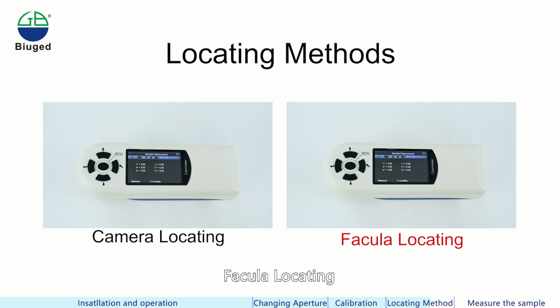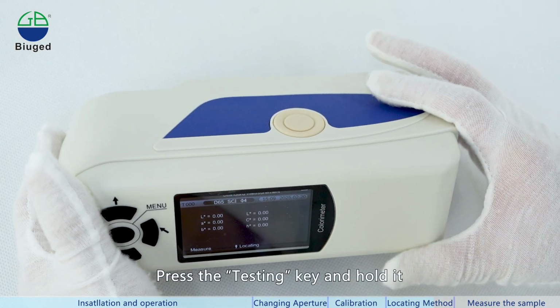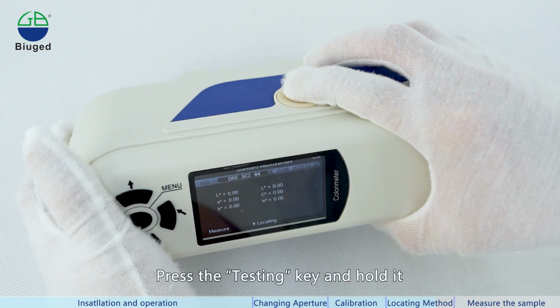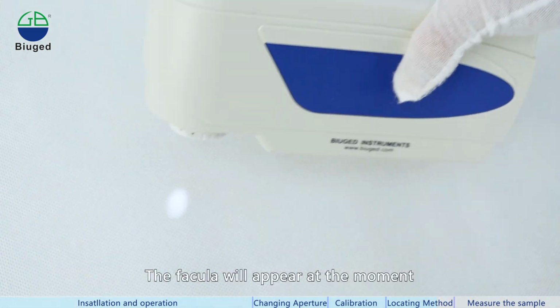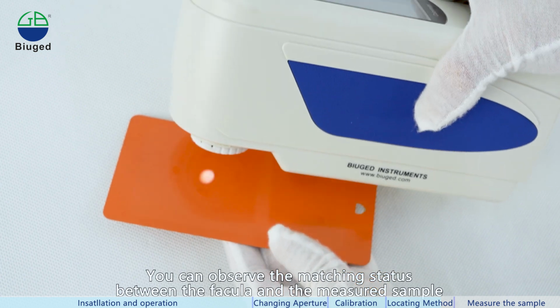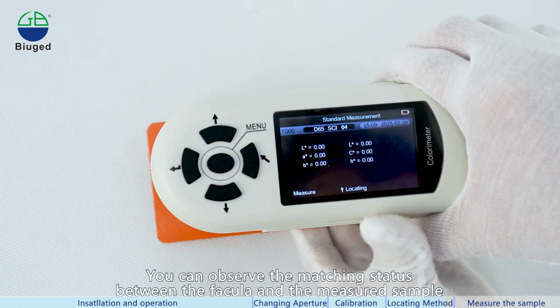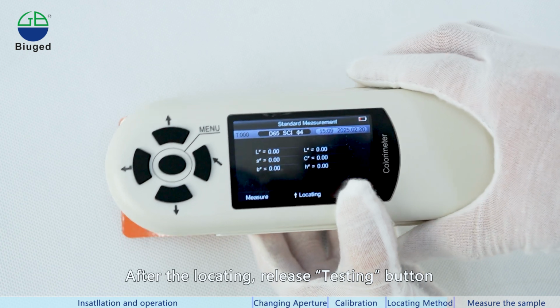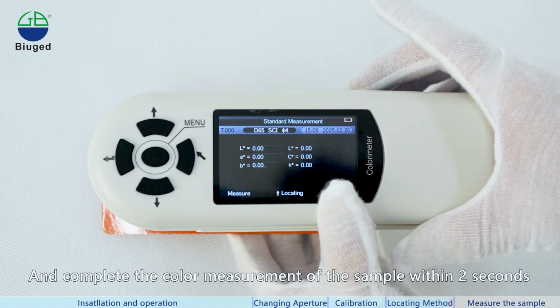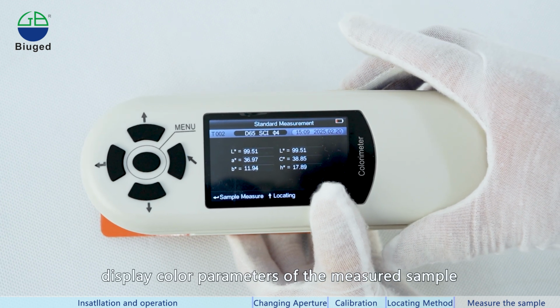Facula locating. Press the testing key and hold it. The facula will appear at the moment. You can observe the matching status between the facula and the measured sample. After the locating, release the testing button, and complete the color measurement of the sample within 2 seconds. Display color parameters of the measured sample.